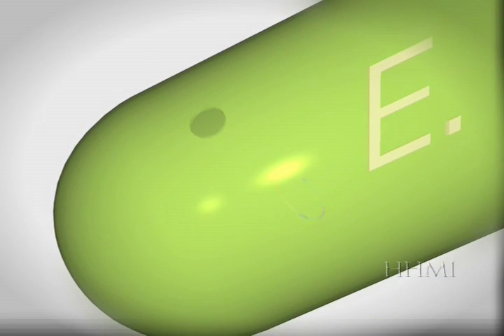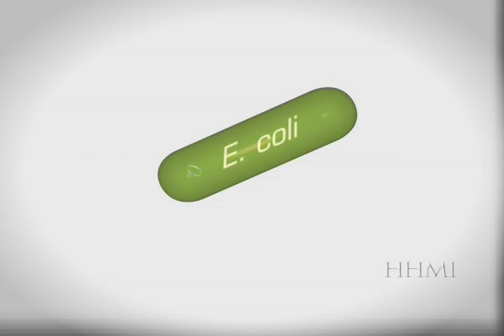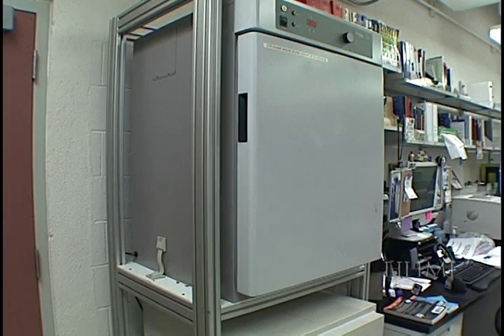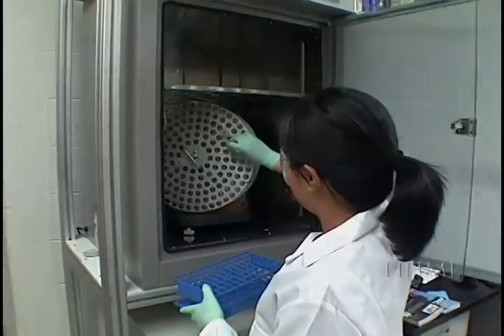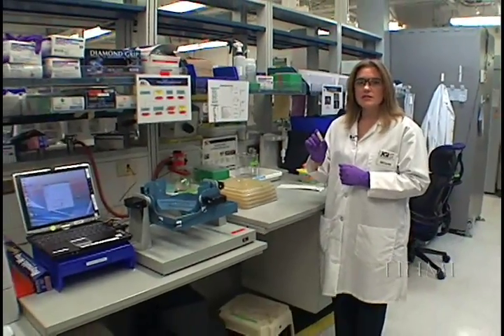These holes are then quickly repaired by the bacteria's natural healing mechanisms. When the bacterium takes in the foreign DNA of the plasmid, it is said to have been transformed, and the process is called transformation. The transformed E. coli are added to media and then placed at their favorite temperature, 37 degrees Celsius, to recover. Electroporation yields about one in a thousand transformed cells that have incorporated a single plasmid. Here's our sample of E. coli bacteria. We've allowed the bacteria time to recover from their shock treatment in the electroporator. Now we're going to take this sample to the plating process, where we will identify which bacteria incorporated the plasmid with our DNA insert.